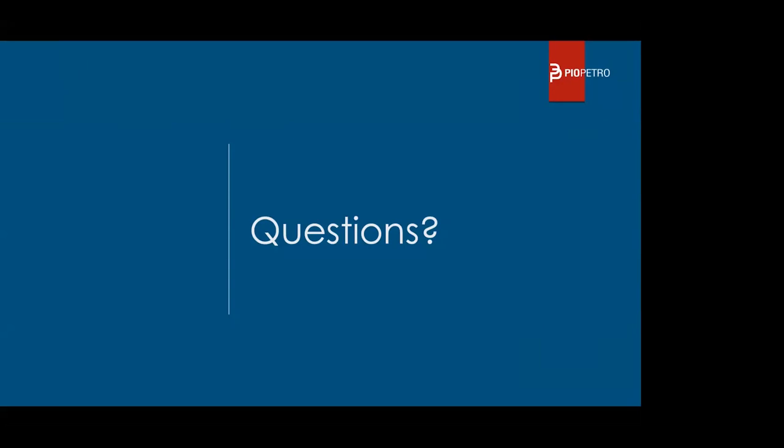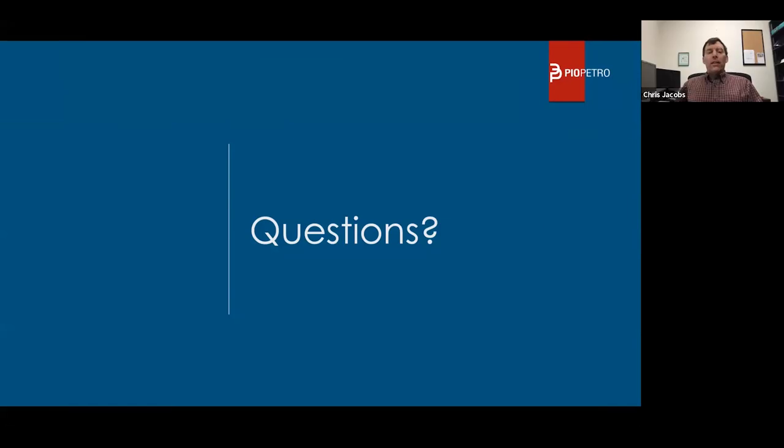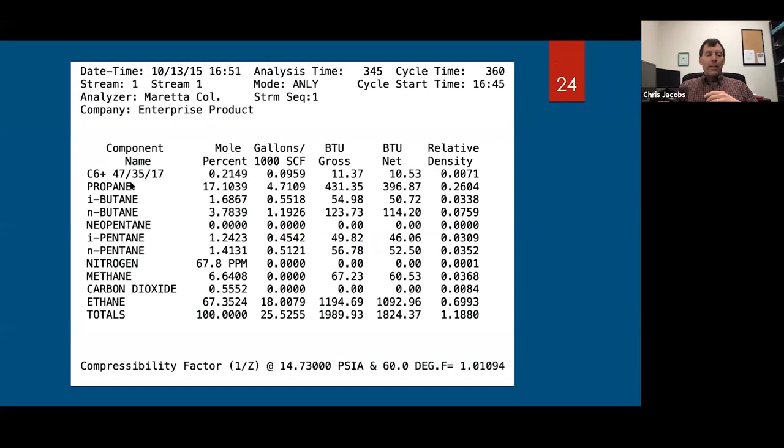Which gas component is majorly used in gas chromatography? If I understand the question correctly, the gas chromatograph will take a gas sample and determine the components. So if you're in the natural gas industry, it's probably calibrated to identify the wet gas samples. Like I said, if you look at this over here, this particular one will identify these two butanes, these three pentanes, nitrogen. You need to have a chromatograph that is designed for the sample that you want to measure. So if your gas does not have these types of items, you probably are not going to be able to sample that. But it's designed to pick up these types of materials. I hope that answers the question.